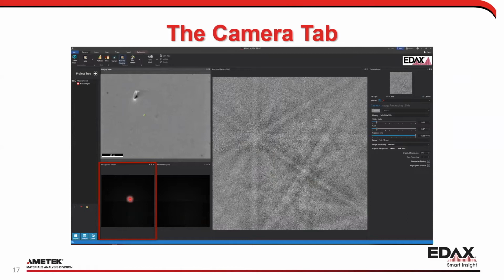How do you mess up your background? Usually it's this button right here, external control. A lot of people do this by accident: they have the EBSD detector in basically point mode. So you're clicked on an area, you go ahead and take a background. Your background is actually that point because you're not scanning, and that would be a bad background. So you actually would see a pattern in the background, and that will cause an artifact in your data.